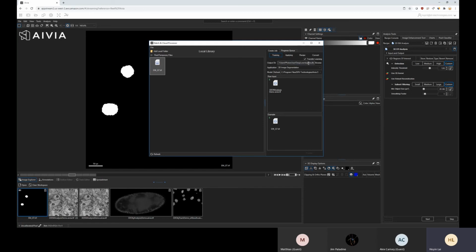And then when I select transfer learning, there is also a new dropdown called model. You can select the model that you want to use for the transfer learning as the base. So your segmentation is just fine. And if you have your own model, then you just need to make sure that you also have that model in your local folder as well.